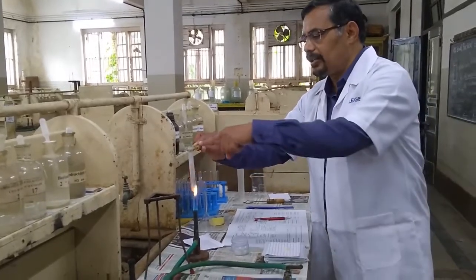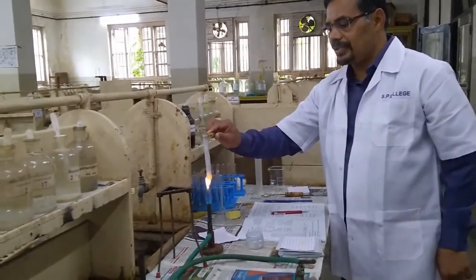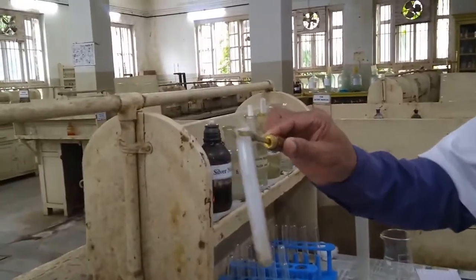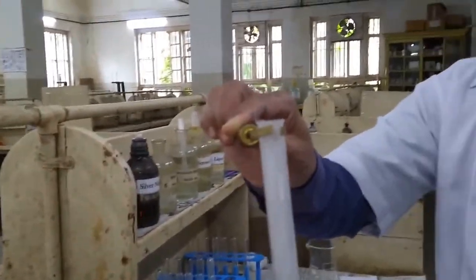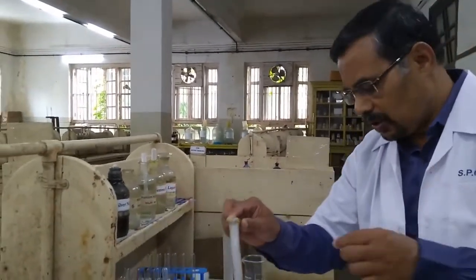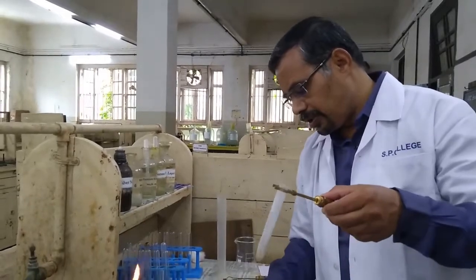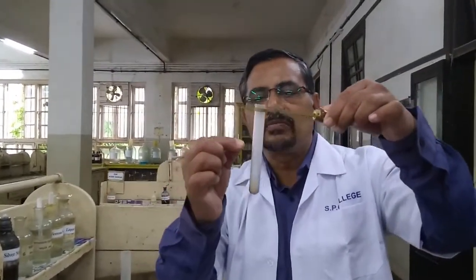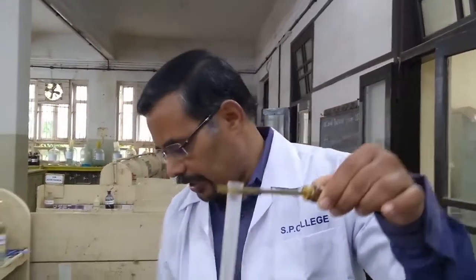For example, here the colorless gas is given out, then this water vapor condenses on the cooler part of the test tube. So first observation here is that small water vapors are condensed on the cooler part of the test tube.